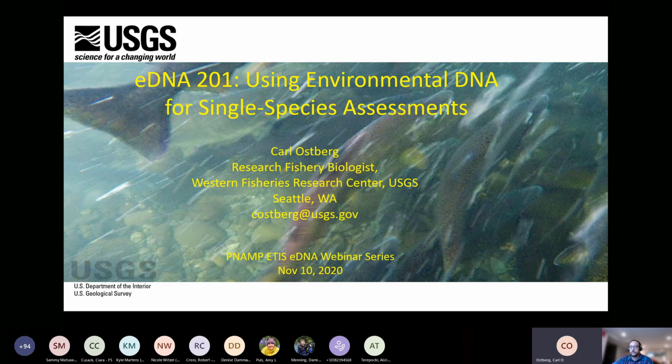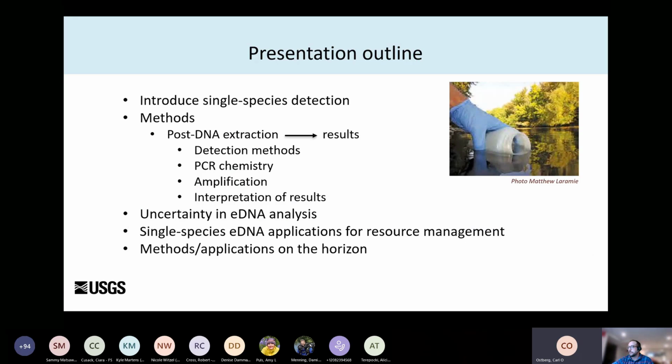So we'll start out with the processes going from post-DNA extraction through data interpretation, and then we'll shift gears and talk about uncertainty, and then identify some single species eDNA applications that are currently ready for use in resource management.